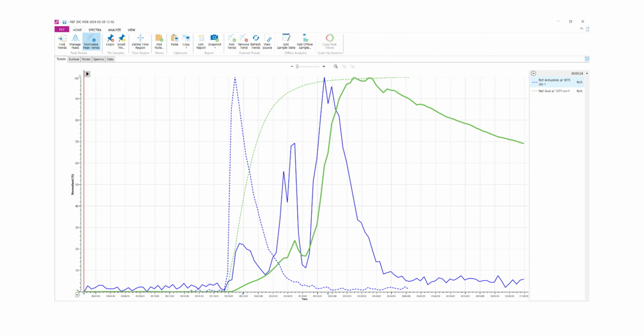When the magnetic stir bar didn't spin correctly, this caused a failed experiment. The dotted lines are from the correctly executed experiment shown previously, while the solid lines represent the same molecules in the failed experiment. EasyMax eliminates the possibility of this happening, but if the experiment failed for other reasons, it would be evident in the captured data.